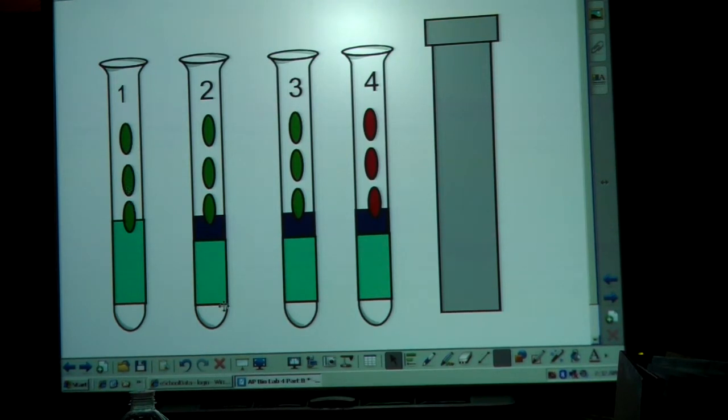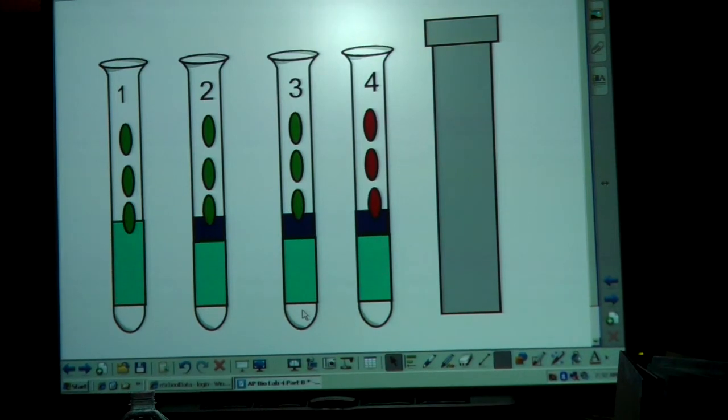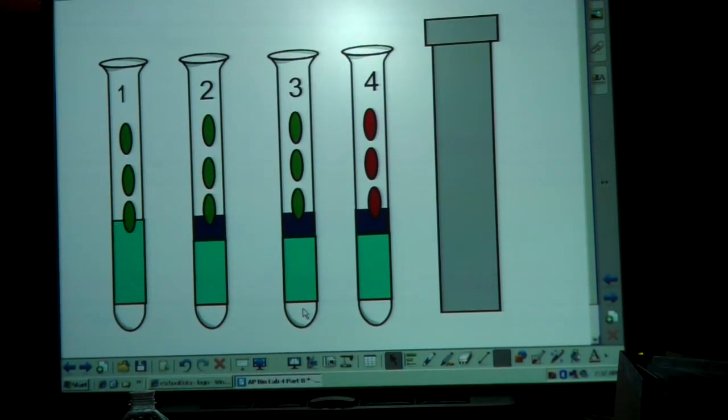Number two gets one milliliter of phosphate buffer, three mils of distilled water, one mil of the DPIP, and three drops of the unboiled chloroplast. Number three is going to get one mil of the phosphate buffer, three mils of the distilled water, one mil of the DPIP, and three drops of the unboiled chloroplast.